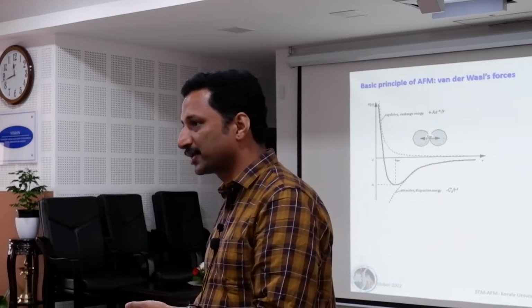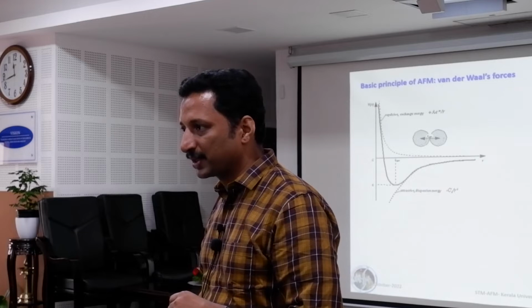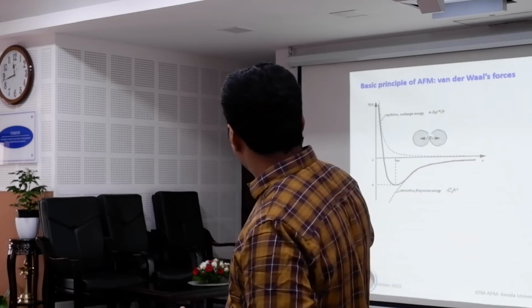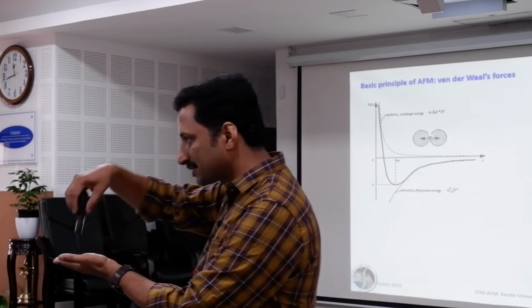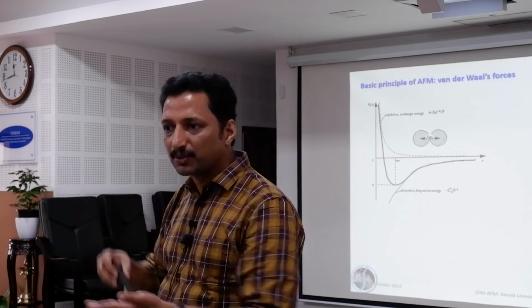During my PhD, I had to develop an AFM. Actually, I will show you, it is called the friction force microscope. The first thing to know whether our AFM is working or not, after making it, is to make a van der Waals curve. We bring the tip closer, and just like we are in the tunneling regime of STM, we will be in the scanning regime of the forces. This is the equilibrium force where the tip is just touching the sample, and then if you scan over the surface, we can get a very good resolution.